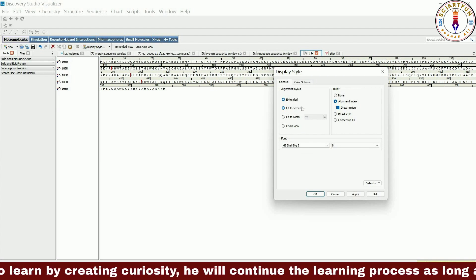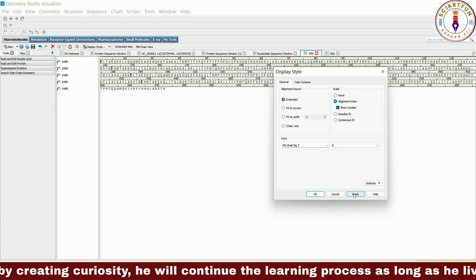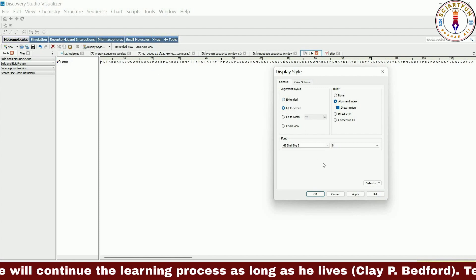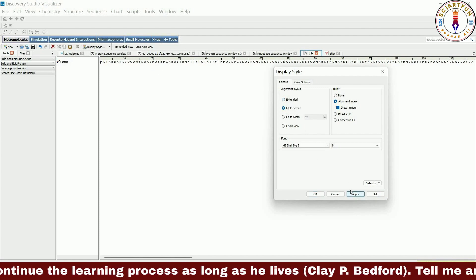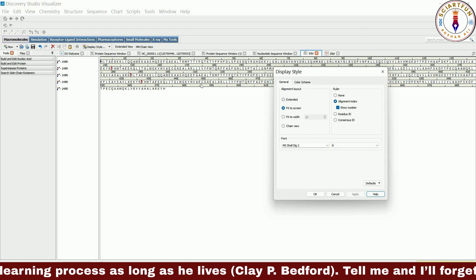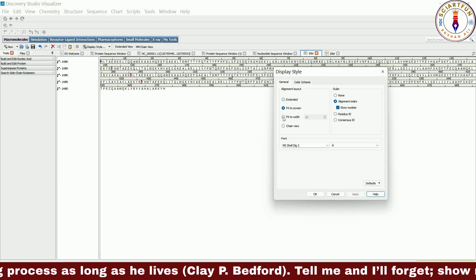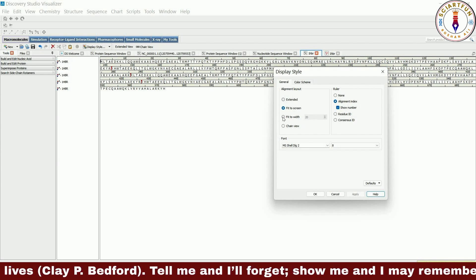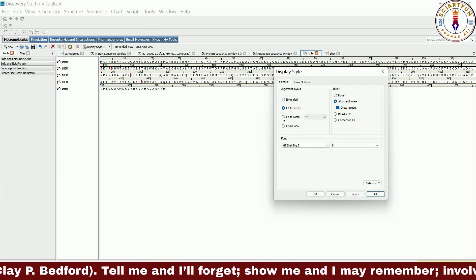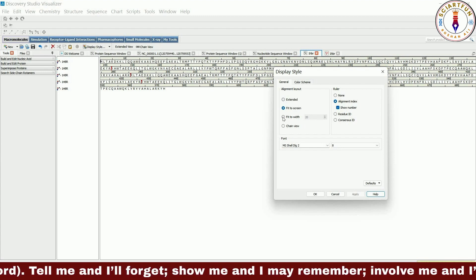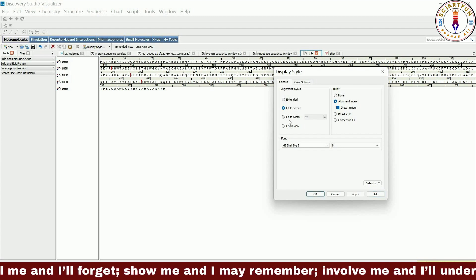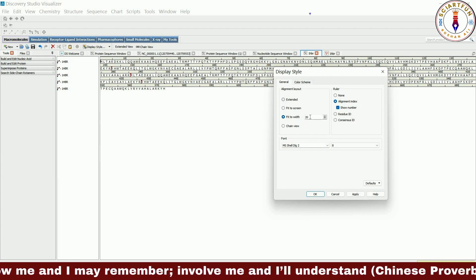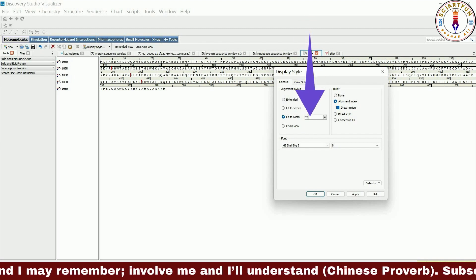First let's select the extended option. This will put all your sequence in a single line. The fit to screen option will fit the sequence to the width of your entire window. The wider the window or the smaller the letters, the more letters will be accommodated in a single line. Once the sequence reaches the border of the current window it then goes to the second line and so on until the whole sequence is displayed.